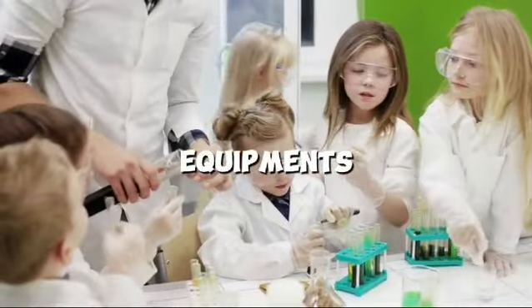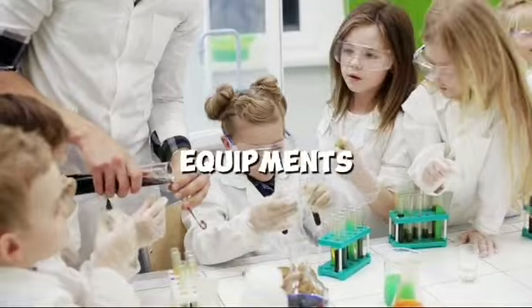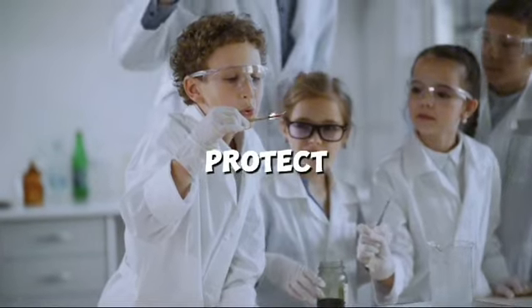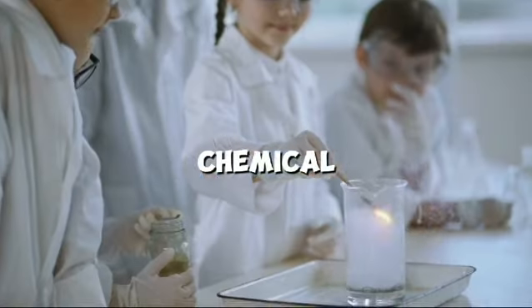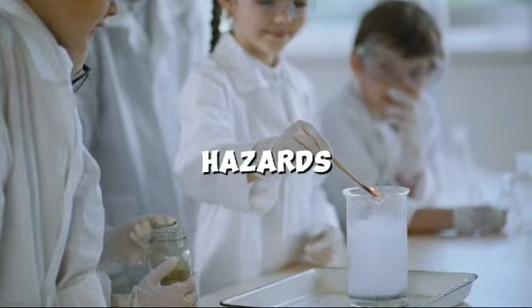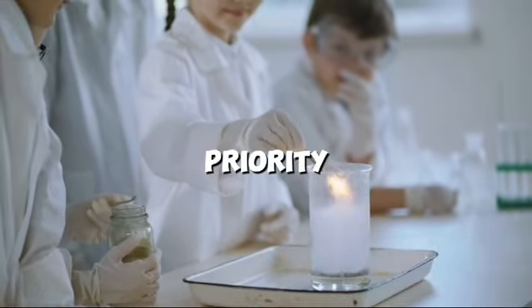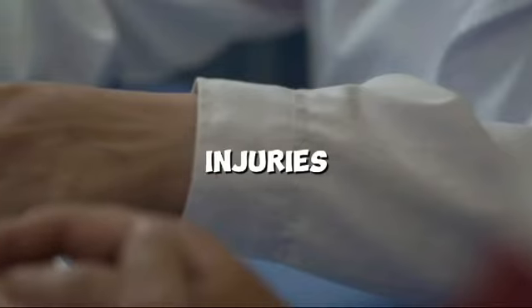Safety equipment. Finally, safety equipment such as gloves, goggles, and lab coats are essential to protect lab personnel from chemical, biological, and physical hazards. Ensuring personal safety in the laboratory is a top priority for preventing accidents and injuries.